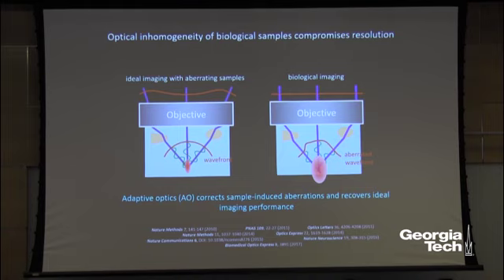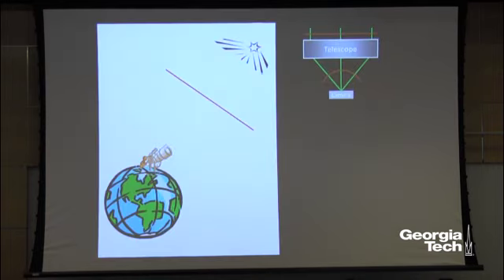It's just to say that we already generated multiple different methods to do that. And you could, if you're interested, ask me a question later on or go to those papers. But I just want to explain to you on the conceptual level that adaptive optics that we do for microscopy was actually very much inspired by what astronomers have been doing for many, many years when they try to image a star using a ground-based telescope.